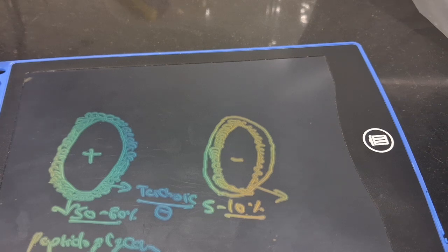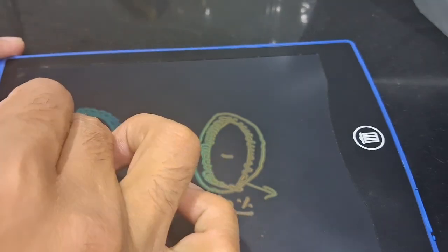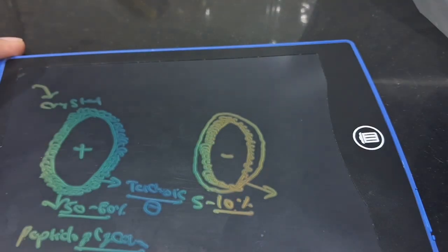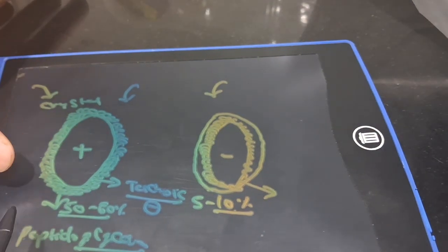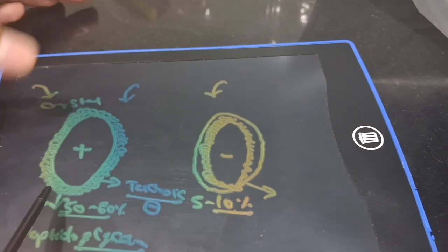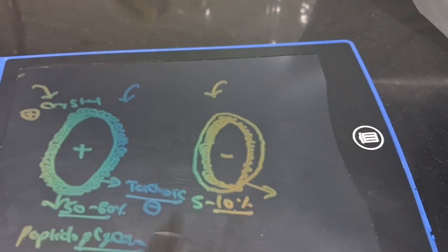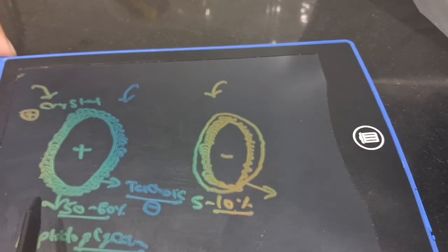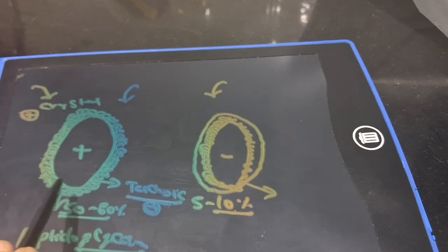Now, in gram staining we use the primary stain. What is the primary stain? It is crystal violet. Suppose we use crystal violet for 1 minute on both gram-positive and gram-negative bacteria. Crystal violet is a positively charged dye, so negative and positive will combine with each other. In gram-positive, the crystal violet will go deep inside the peptidoglycan layer, combine with the negatively charged polymer and stain the cell wall of gram-positive bacteria purple.